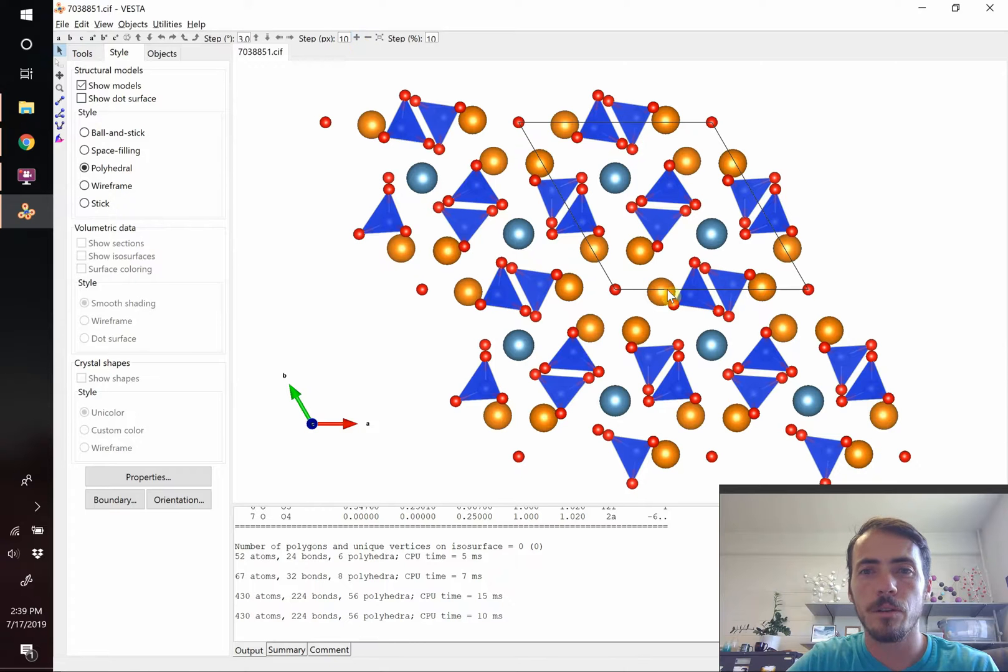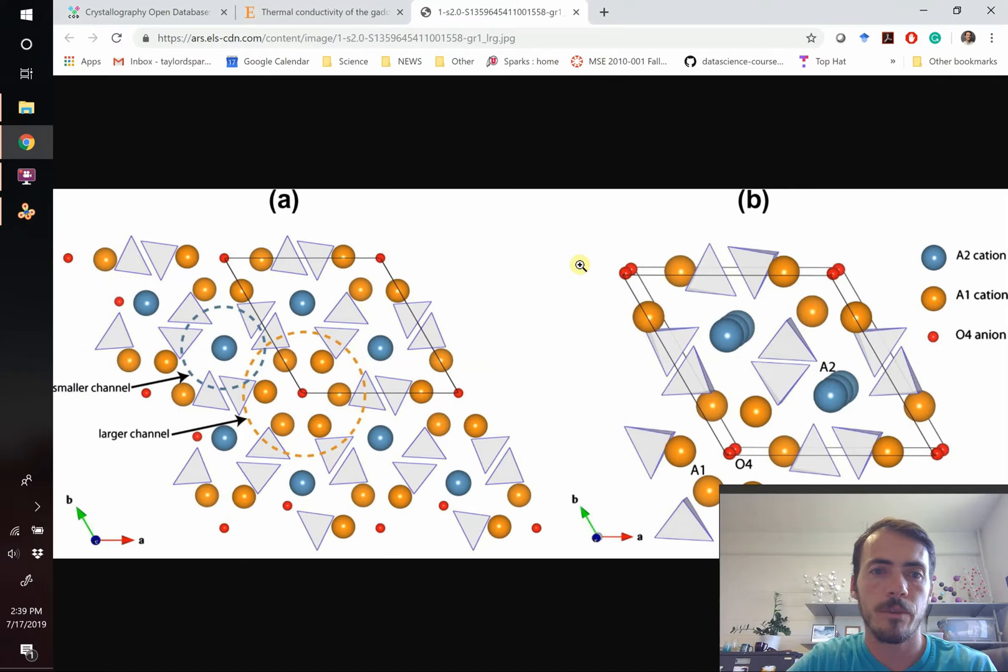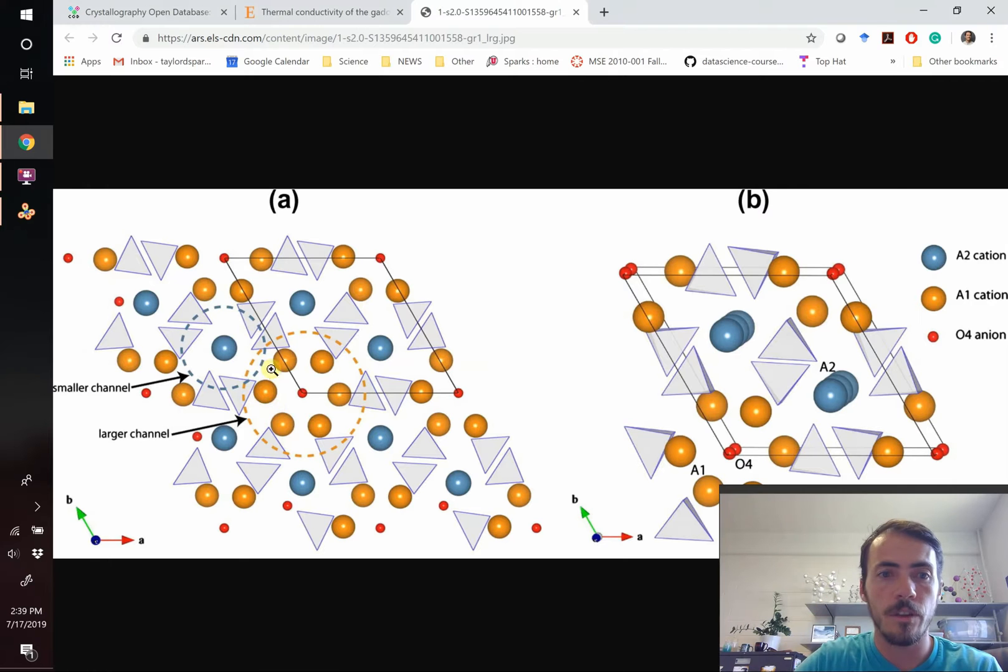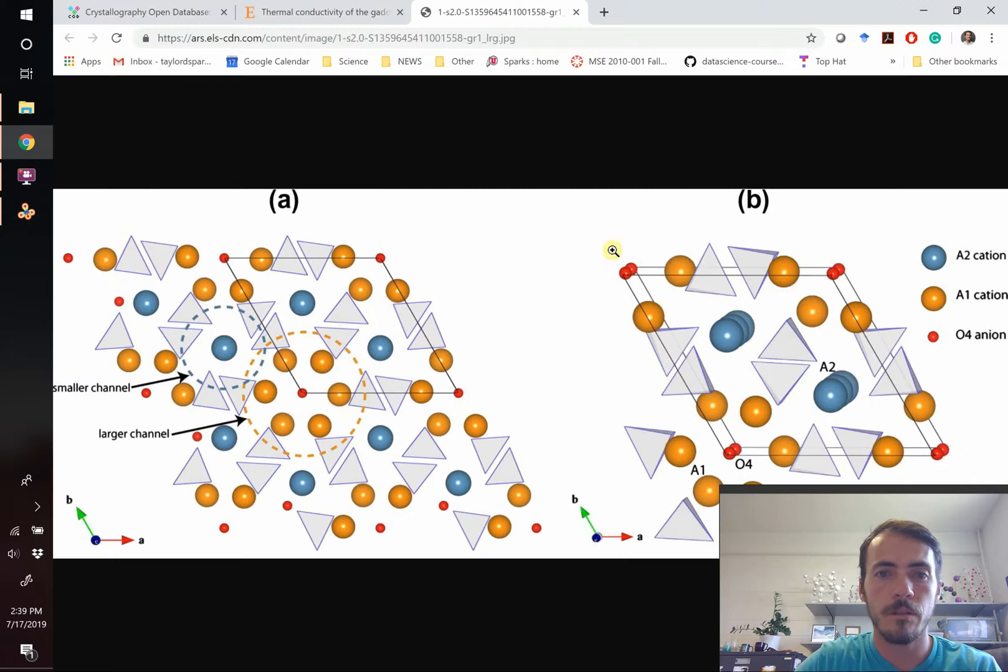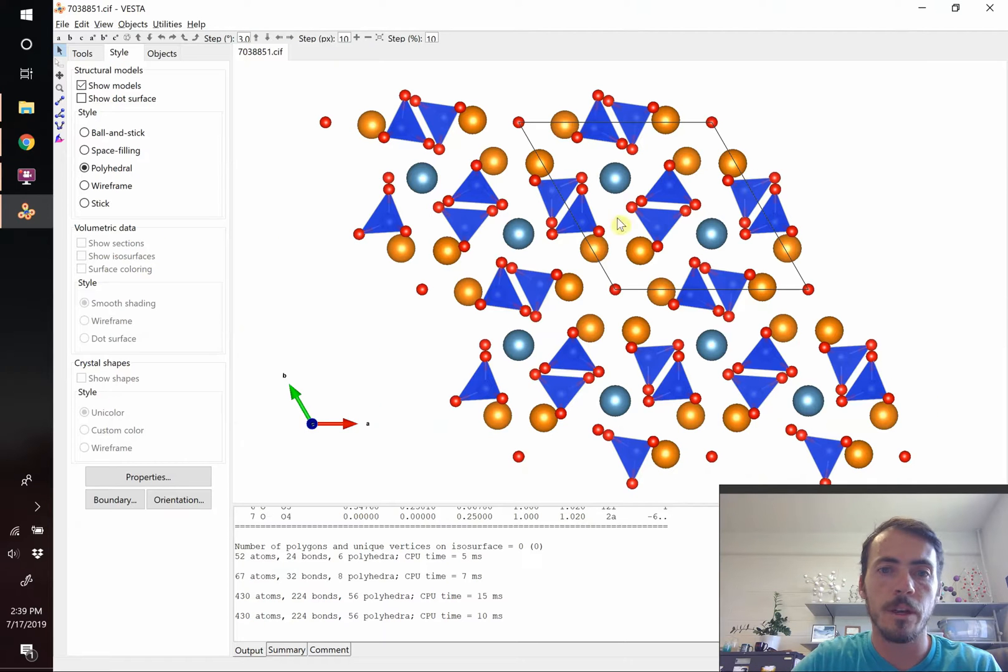This is starting to look more like the crystal structure that we have, starting to look more like this one. You see that this is now a ring, and here's our same ring. So let's make it look a little bit more like it by changing the polyhedra.